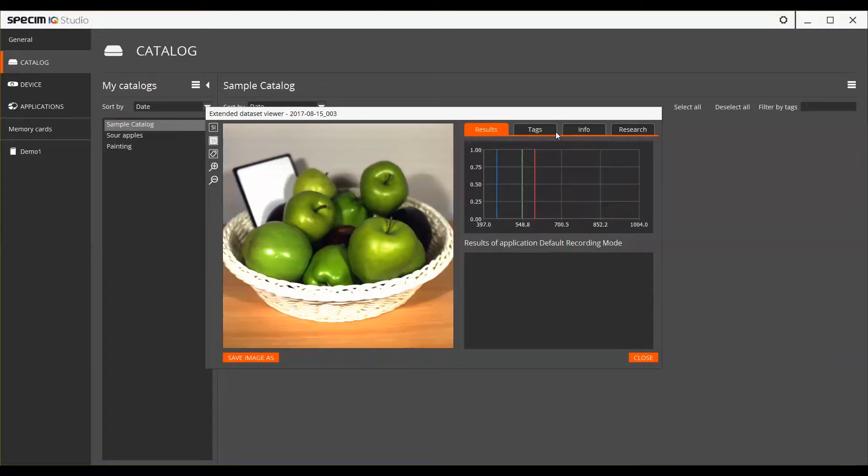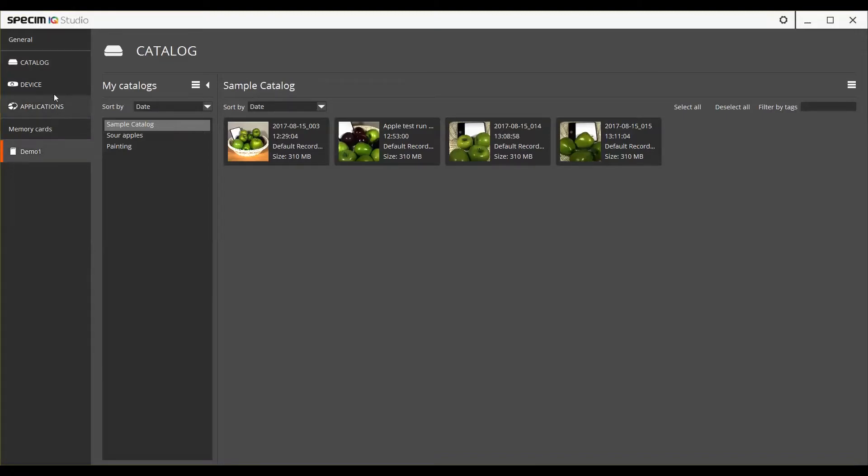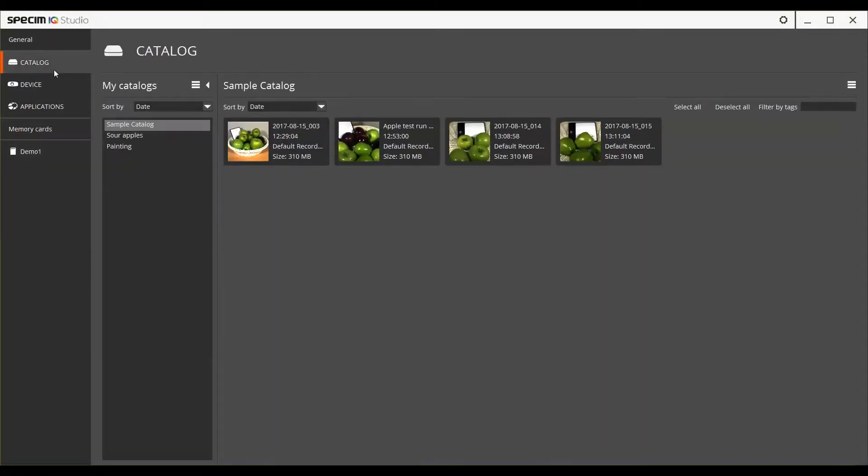The recorded datasets can be imported to the Catalogs directly from the device with a USB connection, from the memory card on the card reader or from a folder on your hard drive. When starting Specim iQ Studio this is the default view.